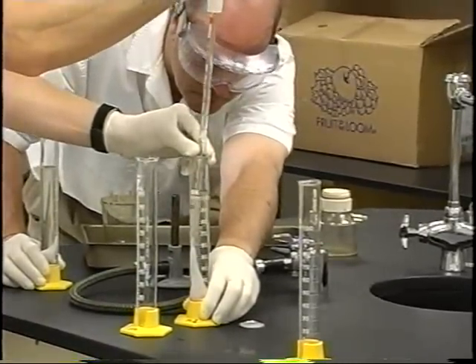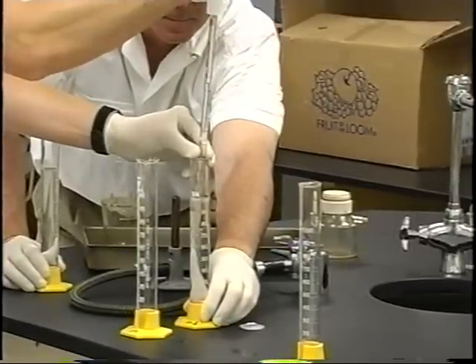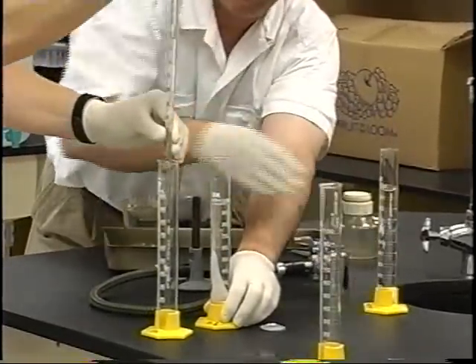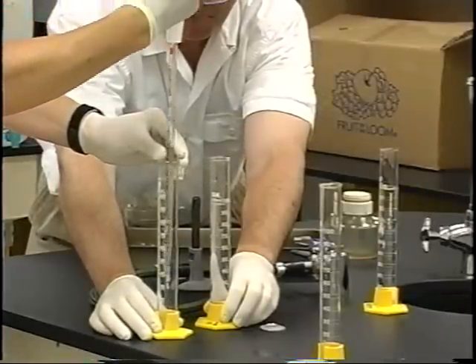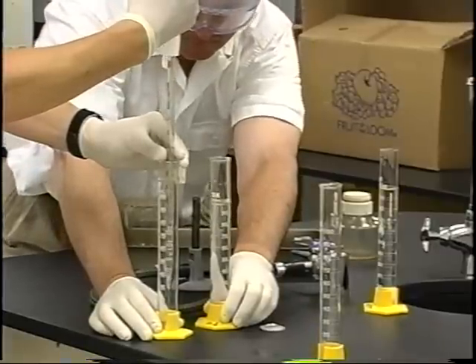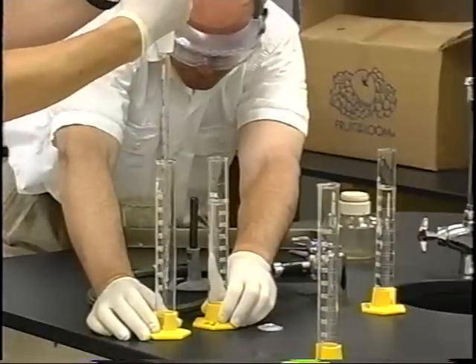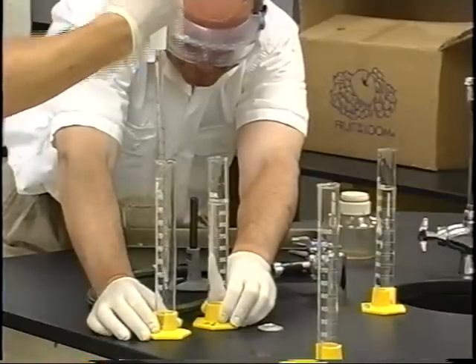And we make these concentrations the way we do. We start with the strongest one and go to the weakest one, just for ease of procedure. It's just easier to cut it down in steps than go the reverse way. When you actually filter your water, you're going to start with the weakest one.